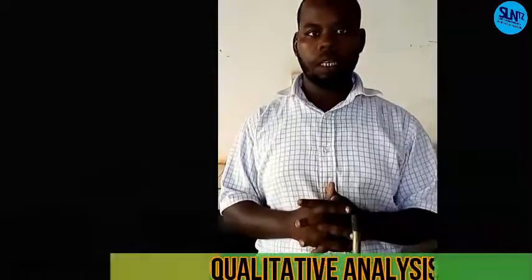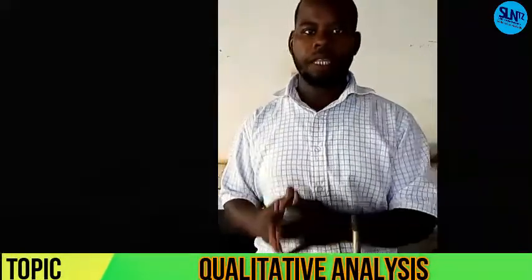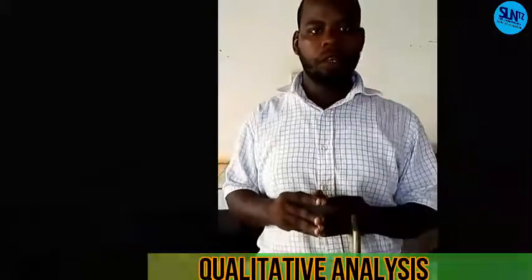Hello students, you are welcome to our lesson of chemistry practicals. Today we are in our topic, that is the series of our lesson, qualitative analysis. So be together with me from the starting up to the end of this lesson. I will show you another step on our qualitative analysis.